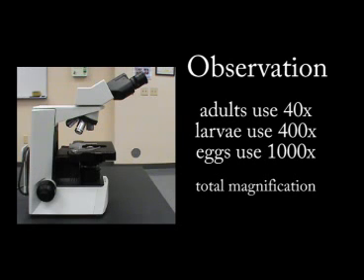For this exercise, you will be using 3 different objectives on the microscope: the 4x, the 40x, and the 100x oil immersion.